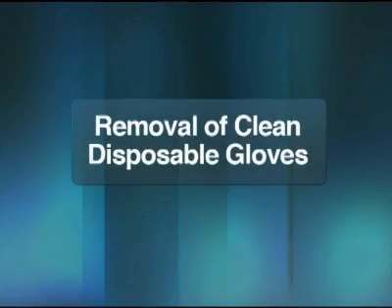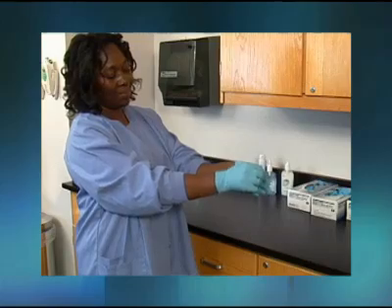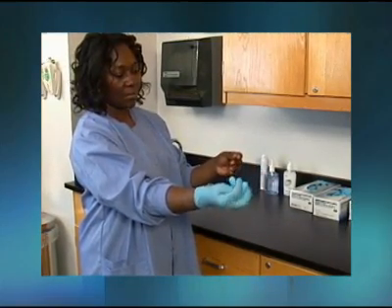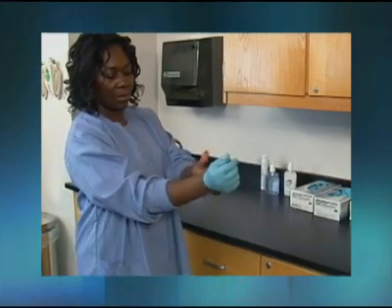Once you are finished with your task, you will need to remove your gloves. Used gloves are considered contaminated. It is important to remove them in a way that doesn't contaminate your clean hands. This protects you from being infected with a pathogen.